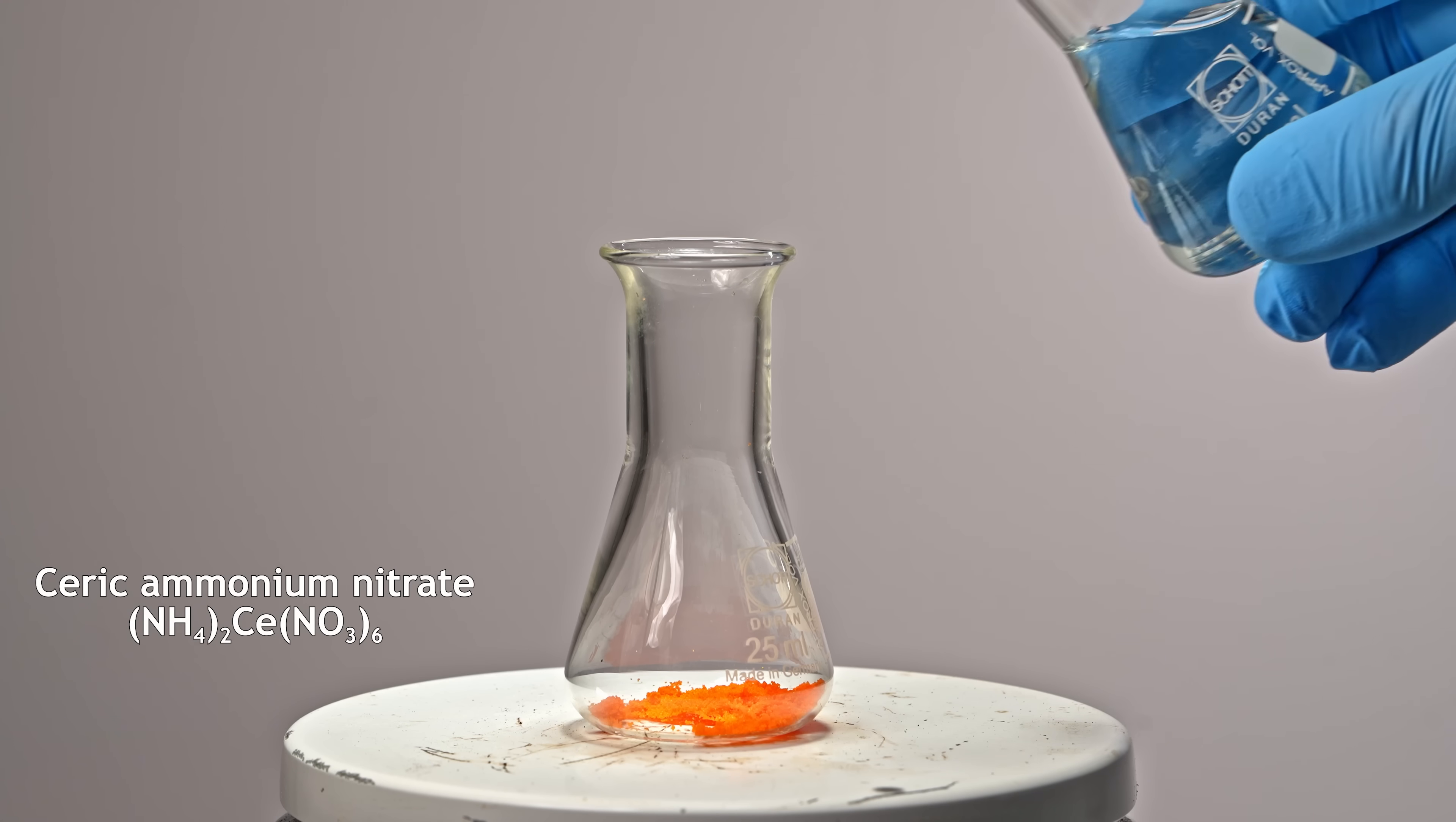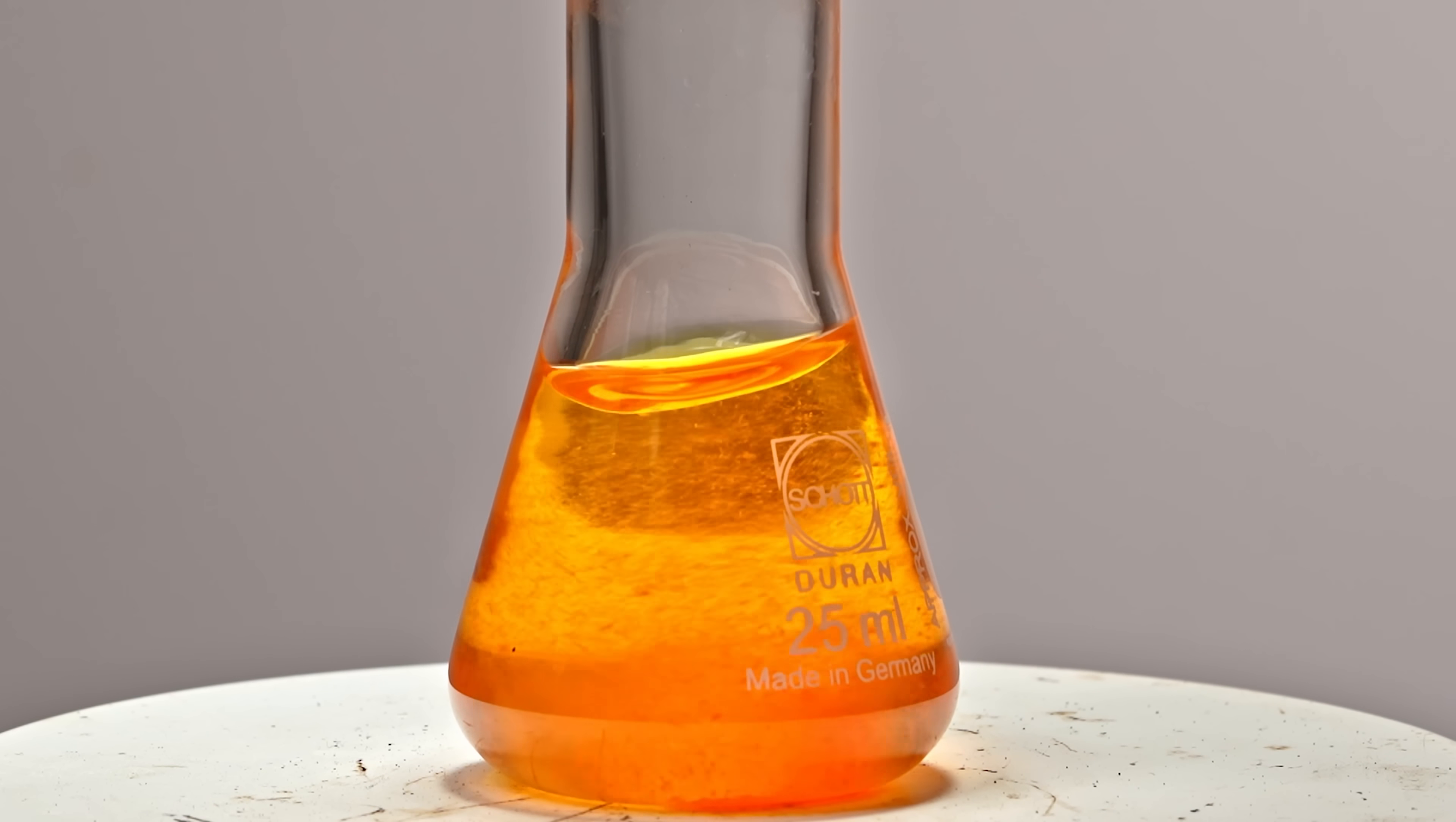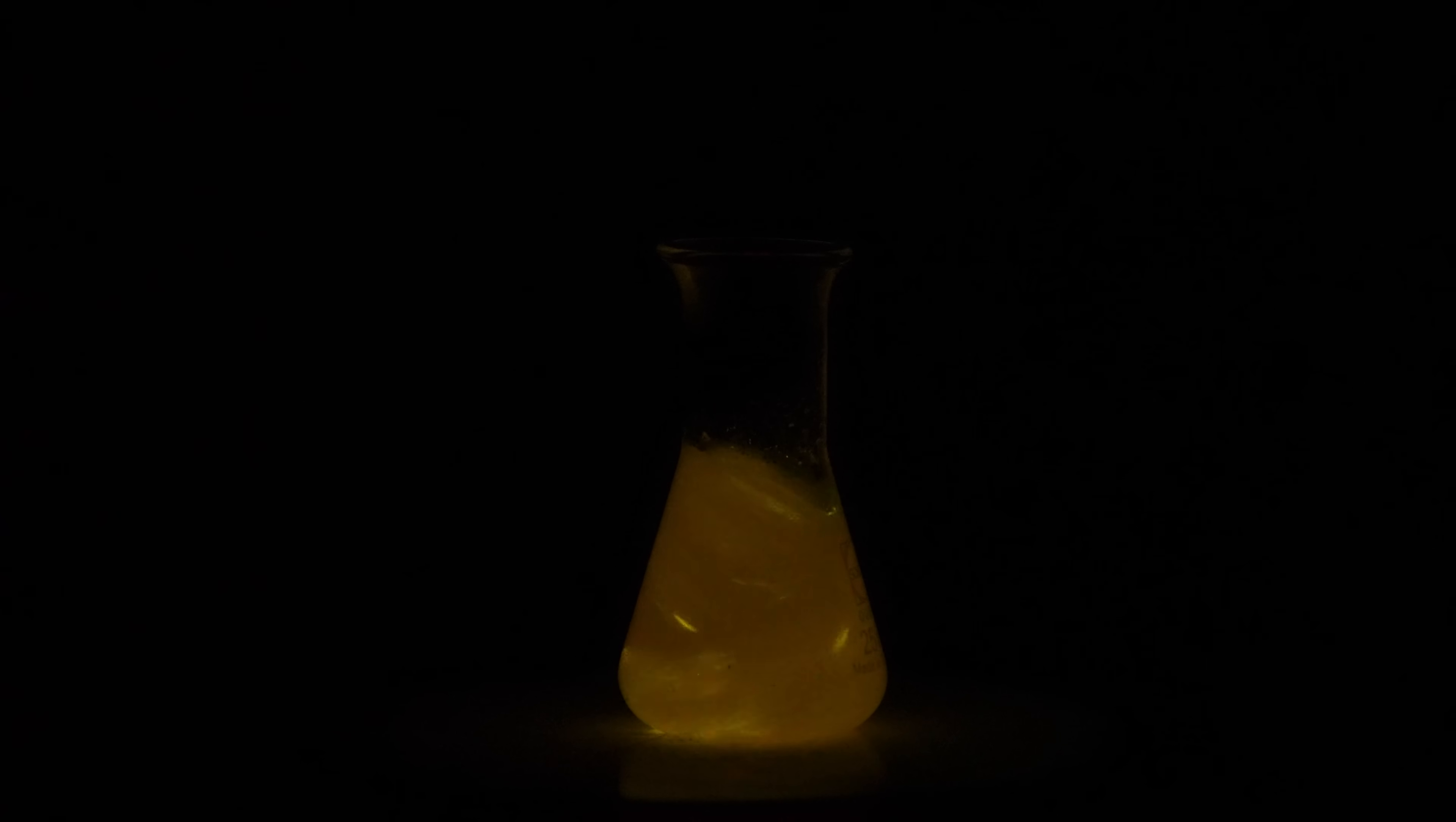One important thing about siloxene. It glows brightly for a short time in acidic solutions, if some metals are present, especially transition metals. In my backstage experiments, the best glow happened with cerium ions 4+. Here I made an acidic solution of ammonium cerium sulfate. Now I'll add siloxene powder in the dark. Look at that. This glowing property is sometimes used in analytical chemistry.